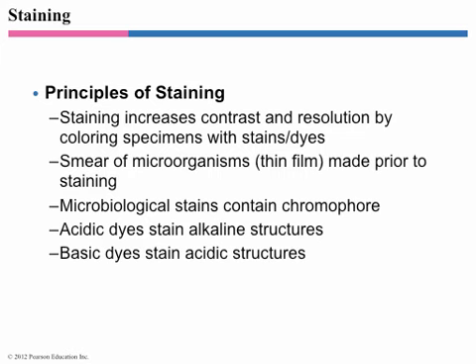But so staining, as we said last time, is a method of increasing contrast in cells, and it is usually done in concert with microscopy. There's lots of different types of stains depending upon the types of organisms that you're looking at. A lot of them are specific for what we call histology, which is the study of usually human or mammalian tissues.